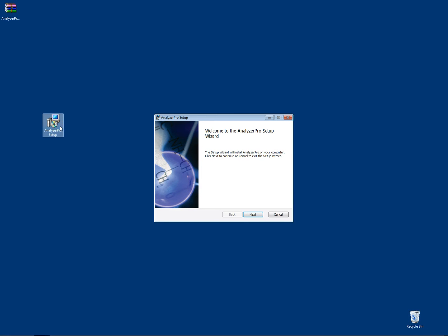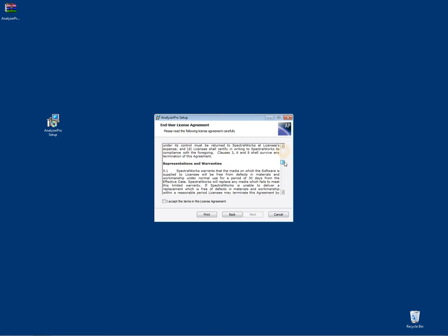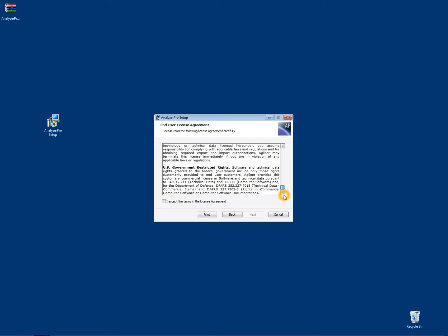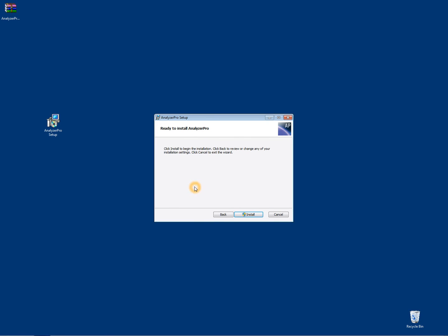Double click on the setup program and follow the wizard. Make sure you read and agree to the user license agreement so that you can proceed to the next step in the installation. Click on a complete installation and then install.